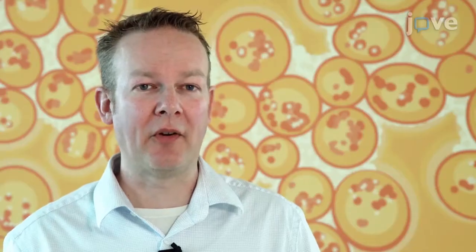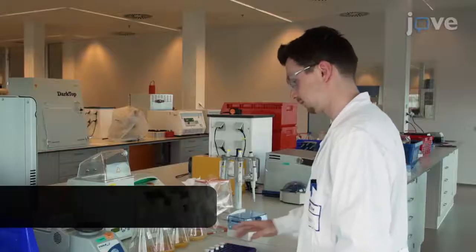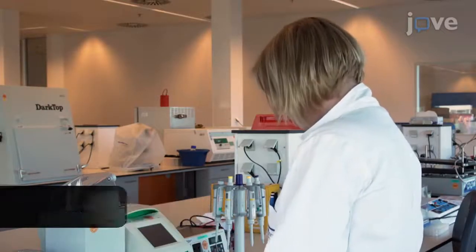Demonstrating the protocol will be Claudia Sierkot, a PhD student, Jeffrey van Wijk, an associate scientist, and Brenda Funk, a senior associate scientist from our laboratory.